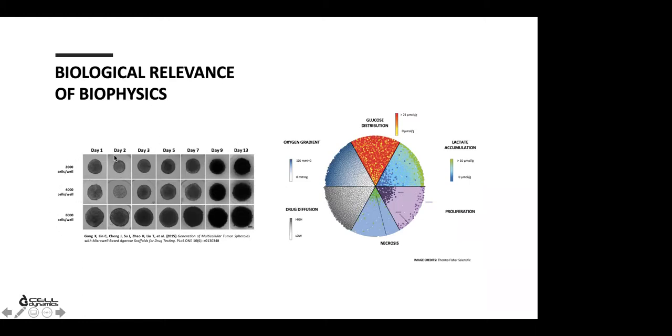Samples undergo a compaction phase from day 1 to day 2, and later on, they start increasing in size day by day, but this sample very fast reaches a plateau phase. So over 250 microns of diameter, the spheroid exposes 3 main layers: the necrotic core, the quiescent intermediate zone, and the outer proliferative ring. And only the cells at the periphery are doubling and viable.